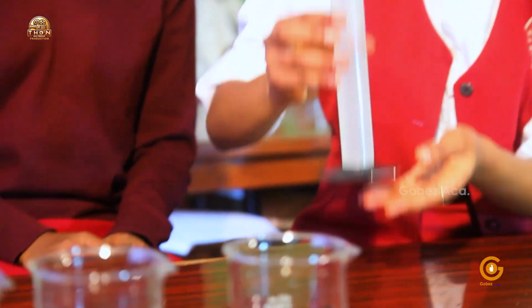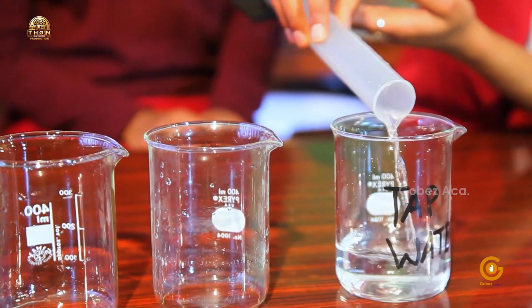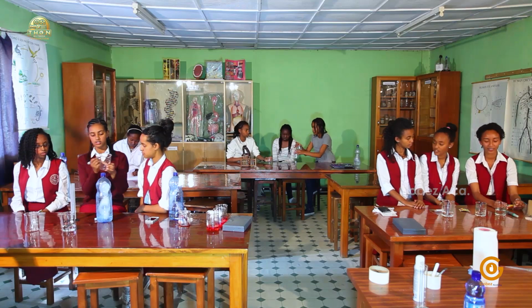Pour water from the tap into the beaker. On the second beaker, I write cold water on it.